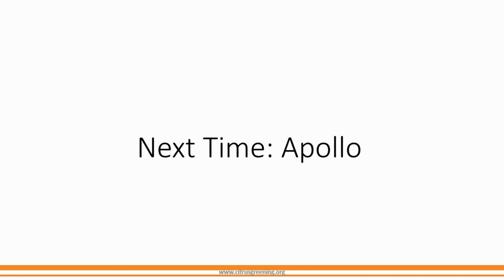So this has been my tutorial on NCBI Blast. Next time we'll have you learning about Apollo and getting into the program and doing annotations and validations.